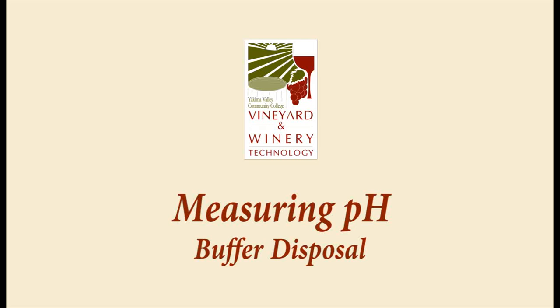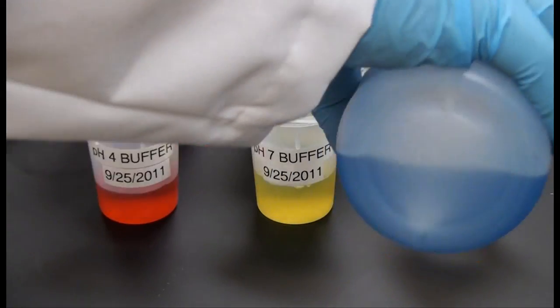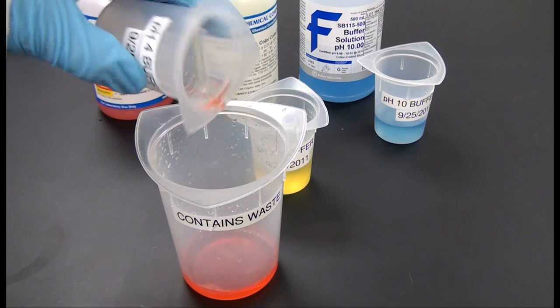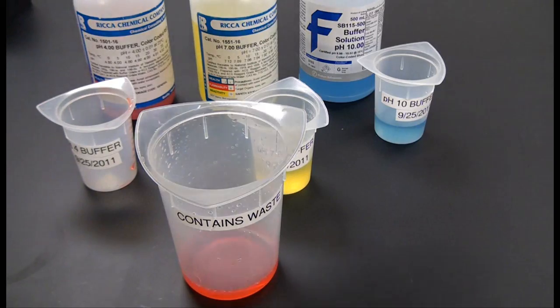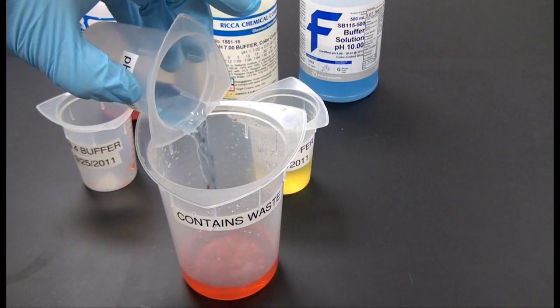pH buffer solutions should be replaced weekly with fresh solution. pH buffer solutions that have been dispensed into containers for calibration should be dated when dispensed. Expired pH buffer solution should be neutralized prior to disposal.